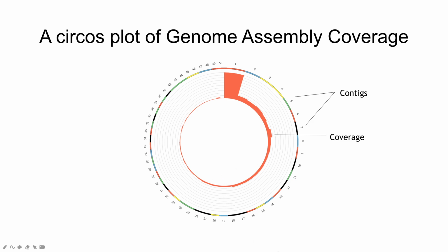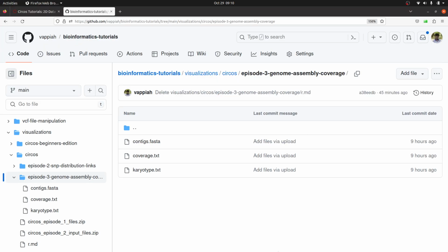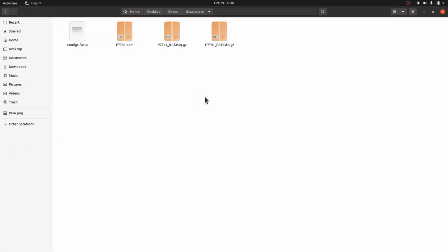Now it's important for you to understand how I got the input file or the information for this plot. So I will switch to this folder here to explain a couple of things. Let me just go back here. By the way, this is where we can get example data, so we'll come back to this. Let's go back to this one.